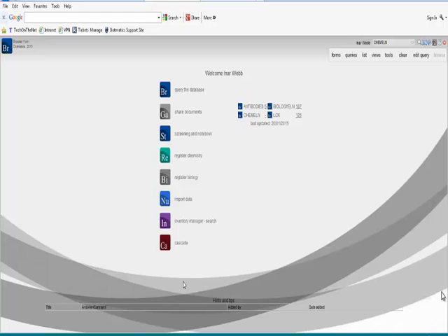So we're starting in Browser. Browser is, if you like, the cornerstone of the product. It's where we organize the data, and we can divide the data into what we call projects. And a project in Browser is just a collection of things on your database. So these could be a collection of experiments, it could be a collection of compounds, it could be a collection of antibodies, it could be a collection of customers.